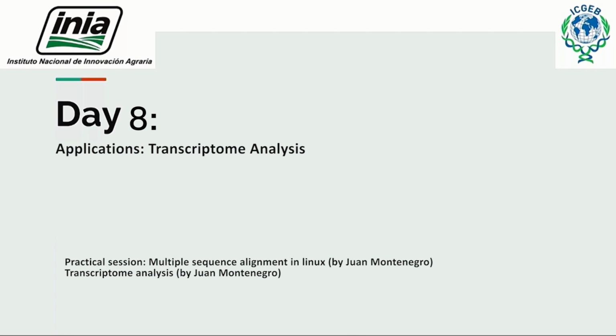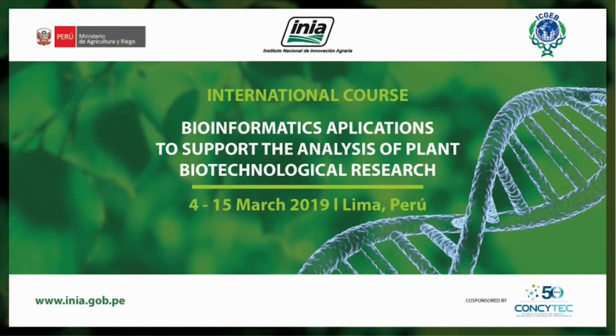We're just going to see a different tool outside of R, just using Linux, to pretty much perform the same thing you did with David yesterday: how to do a multiple sequence alignment from the Linux command line, using pretty much the same algorithm David used.